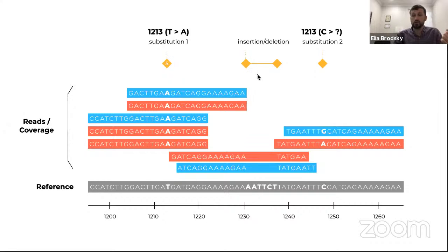And then sometimes we also can have multiple regions or multiple letters inserted or deleted. If we have such an indication, these are called indels. So, different types of analyses. One of the primary ways to characterize such data is what's called variant calling. When we say variant calling, it's to distinguish between variants like this and all the other types of variants that we have low quality of information about.